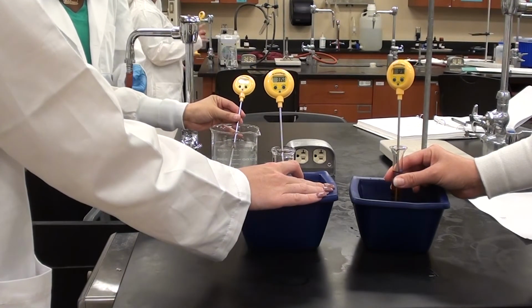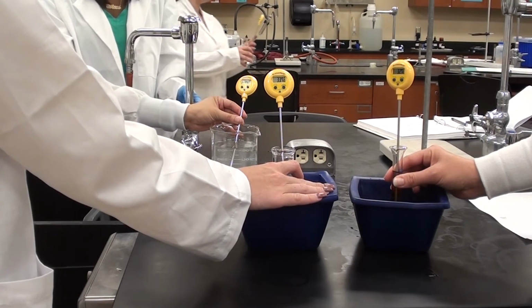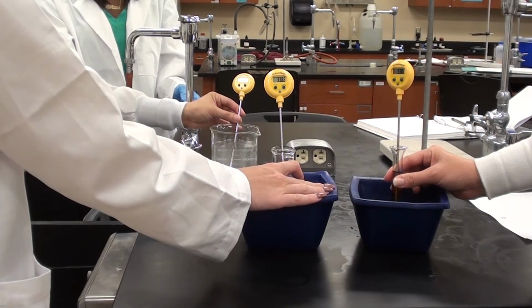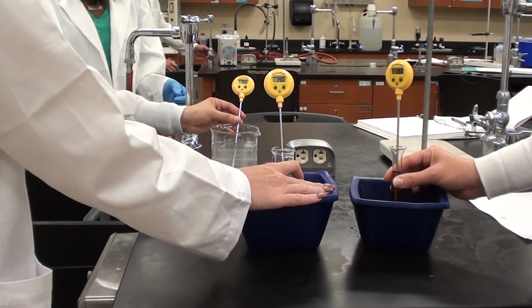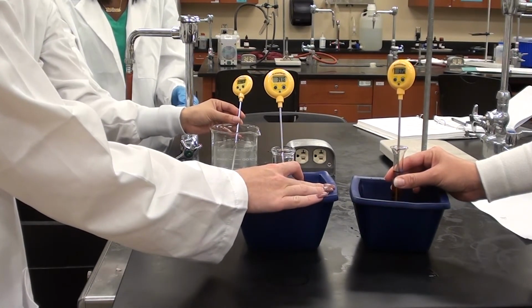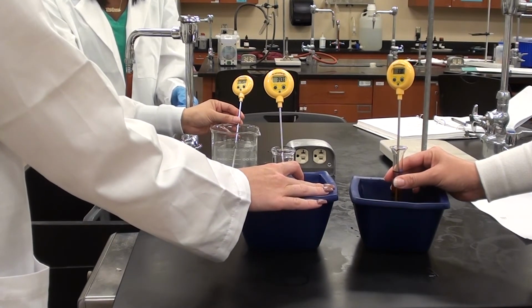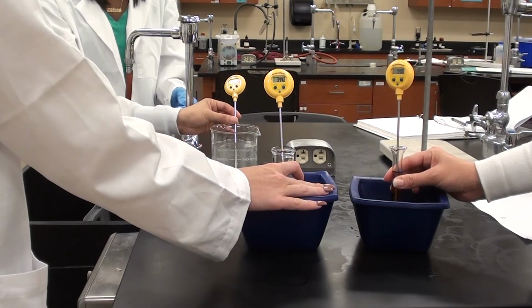If we can't get up to 40, that'll be fine. 38 or 39 will be fine. As long as both solutions have the same temperature, that's going to be the most important consideration here. Now if you don't have access to hot water, you can use a hot plate and heat the water to around 45 to 50 degrees and use that as your bath here.